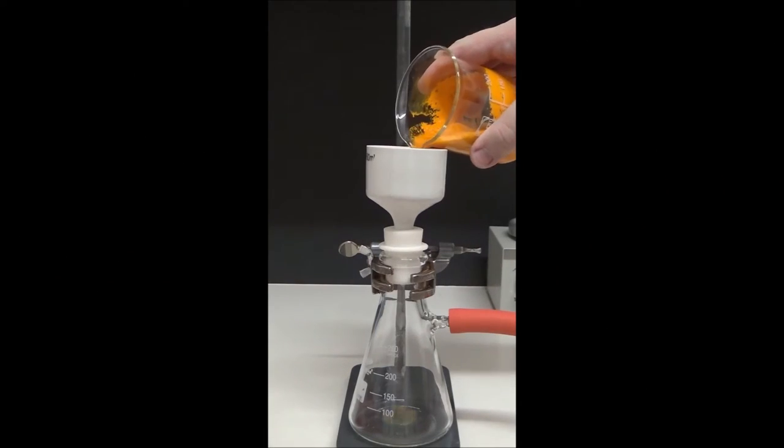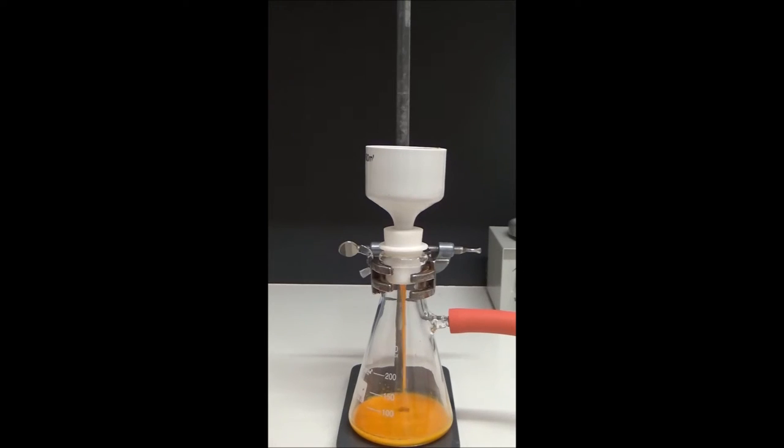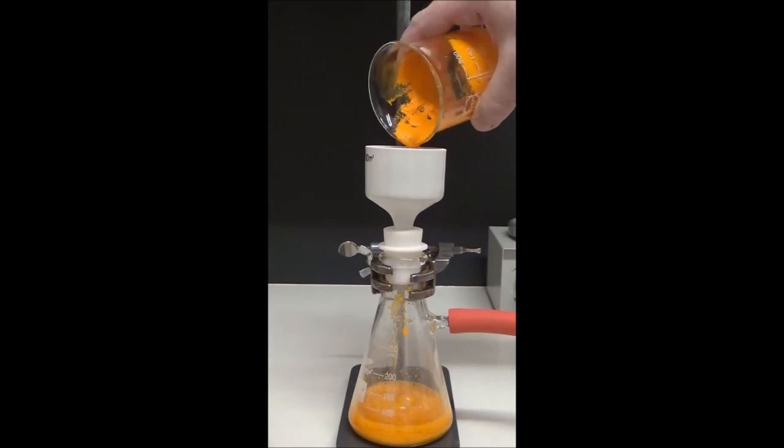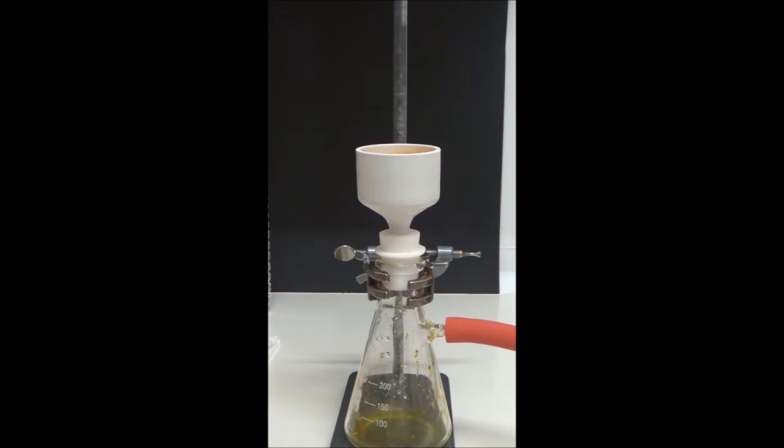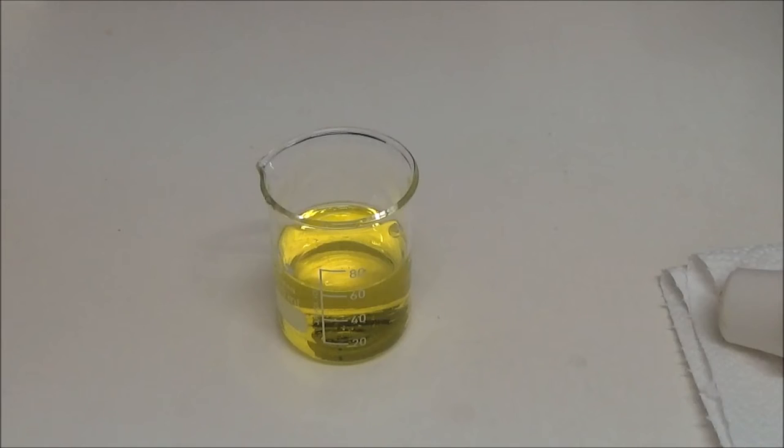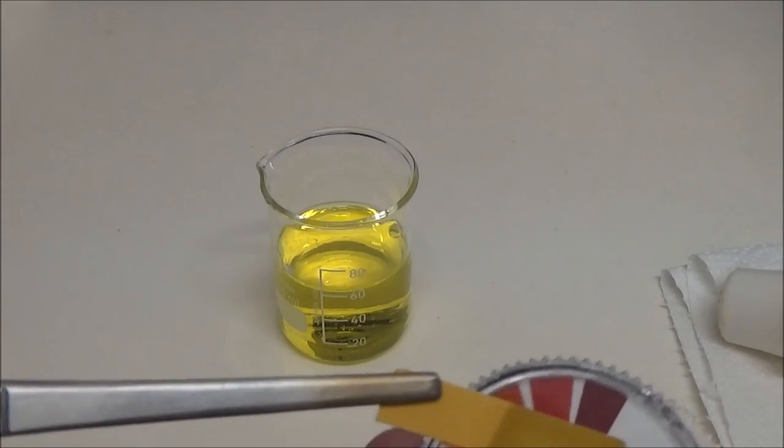The precipitate was then removed by vacuum filtration. Since initially quite a lot of solids went through the qualitative filter paper, the filtration process was repeated twice more until only a clear liquid went through. The residue was then rinsed three more times with distilled water until the pH of the flow was only neutral to slightly acidic.